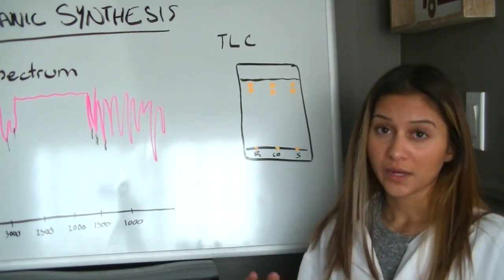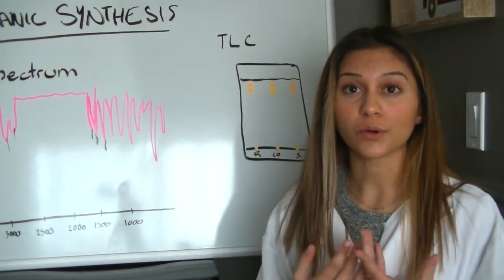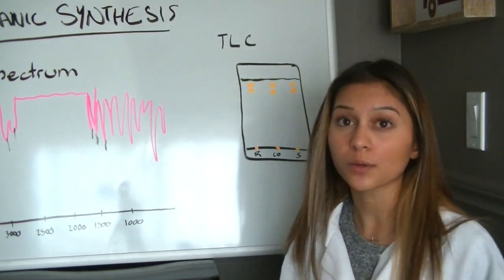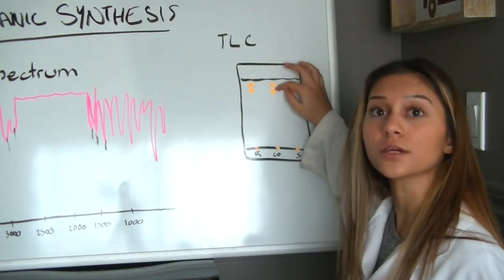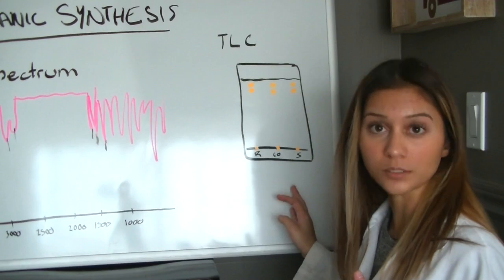The TLC plating technique allows us to observe the purity of our product. The TLC plate shows us that we have little to no impurities, as it is seen that there are 2 dots in the co-spot that match the Rf values of the R spot and the S spot.